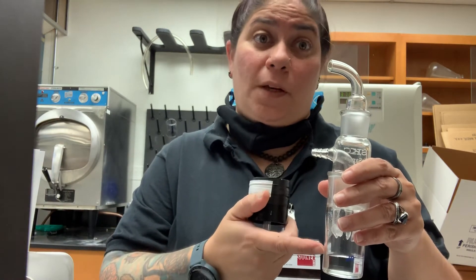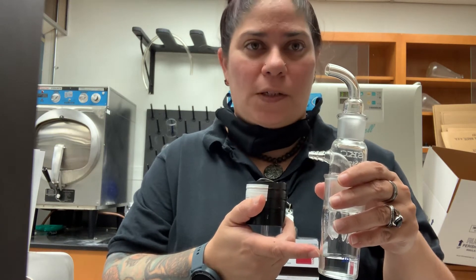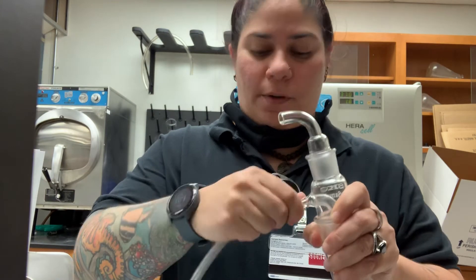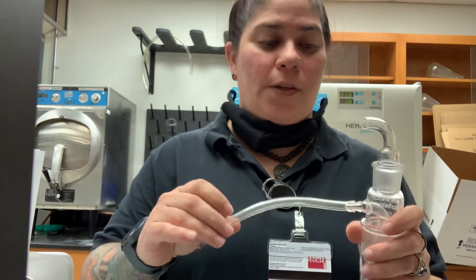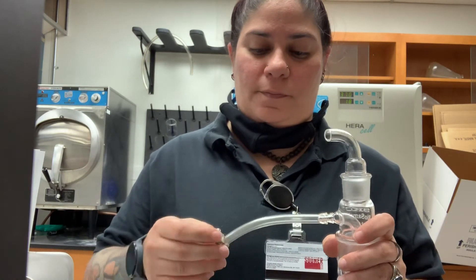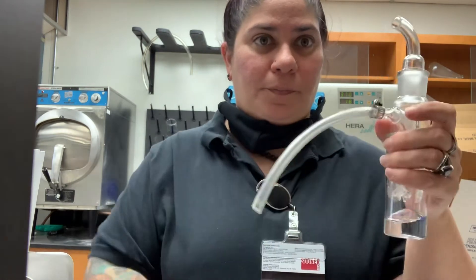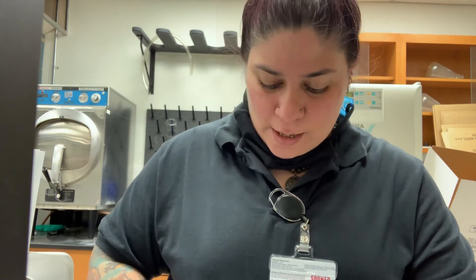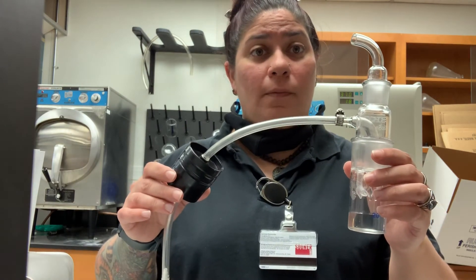Now, because some particles could be re-aerosolized — this device is fairly turbulent, although less so than its predecessors — it is necessary to put an inline filter to capture those particles and prevent contamination of the pump. We attach a piece of Tygon tubing to the biosampler using a clamp to keep it in place, then connect the Tygon tube to the inlet of an inline filter assembled exactly like the filter cassettes discussed previously.